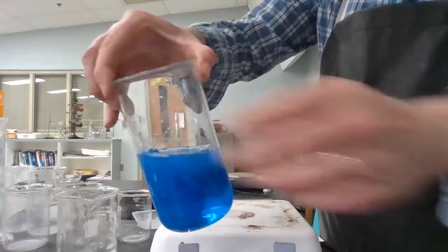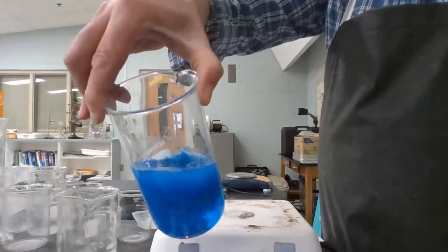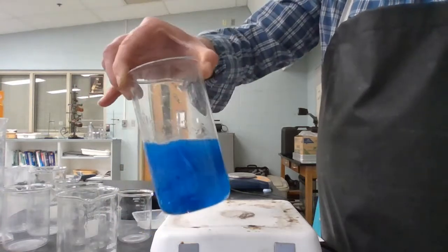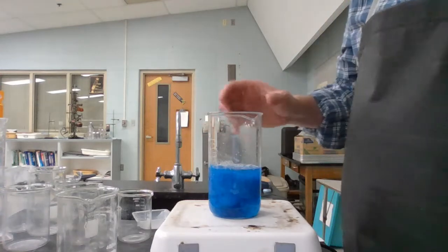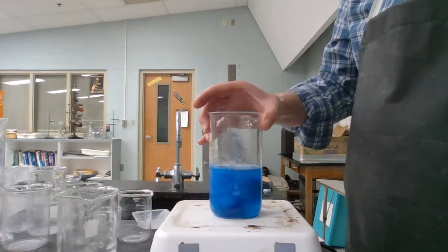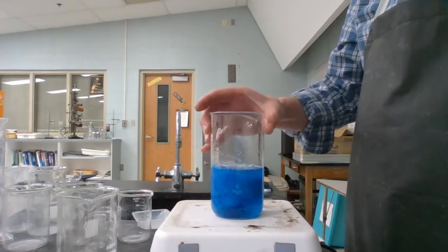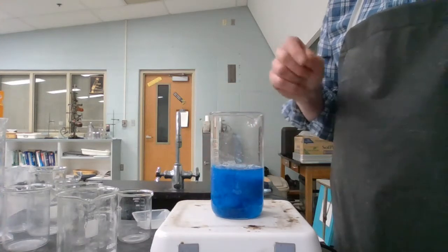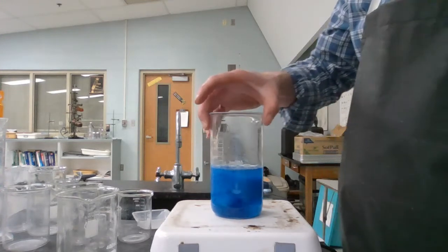Kind of like a blue Slurpee. So I made a precipitate, which is a solid. Now what we're going to do is heat that. And so what we got in here is copper hydroxide now. It was sodium hydroxide and copper sulfate and sodium sulfate. So the solid we see is copper hydroxide, and we'll see that in our reactions.